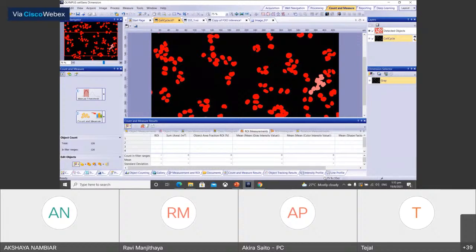Where this thresholding option is present in CellSense Dimension: there are two types of the count and measure function. You can see this panel called Count and Measure. One is Count and Measure basic, and another is an optional solution, which is called Count and Measure full option.